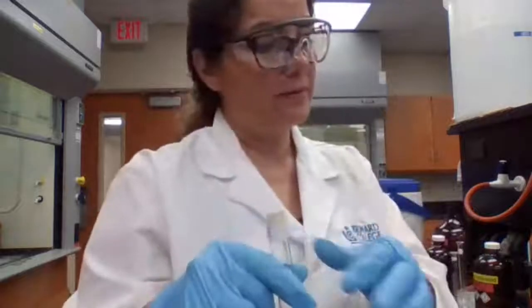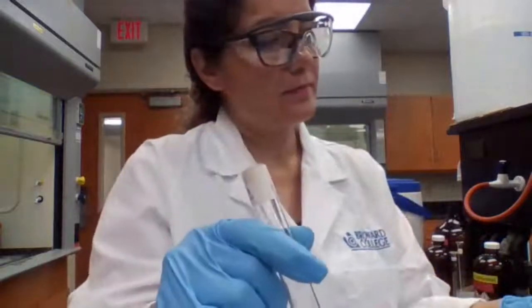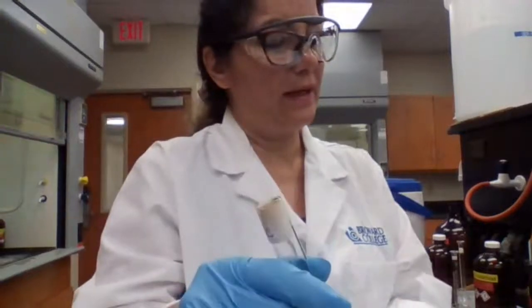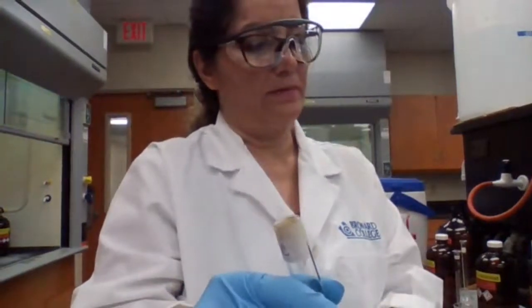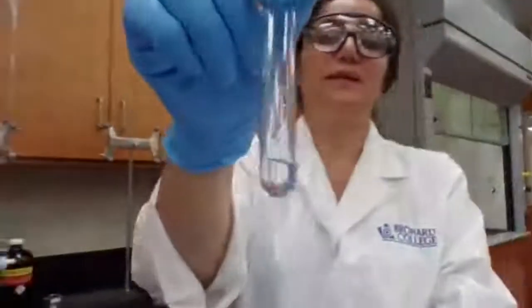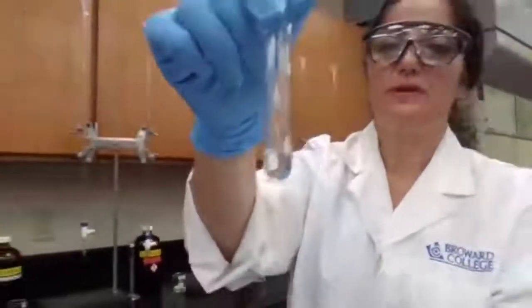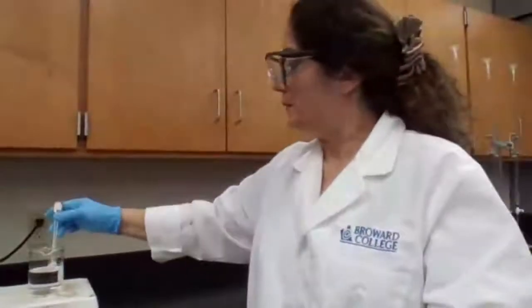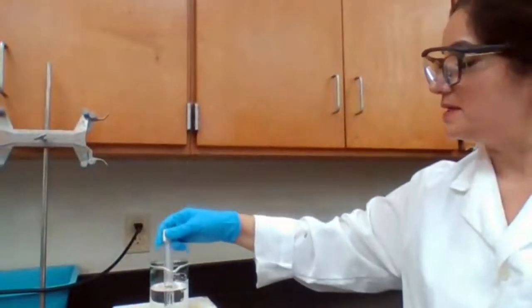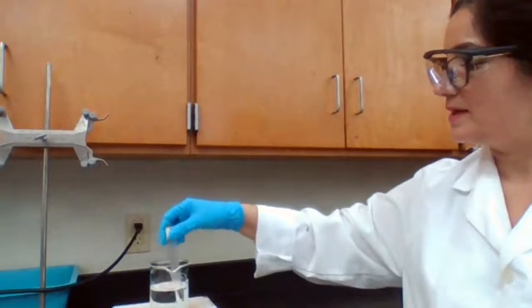Saturated ammonium chloride. And we are going to place it in hot water, in boiling water. So saturated, there's no crystals in there, right? There's no crystals. We place it in a hot water bath. We want to see what happens if we place the saturated ammonium chloride in the hot water bath.